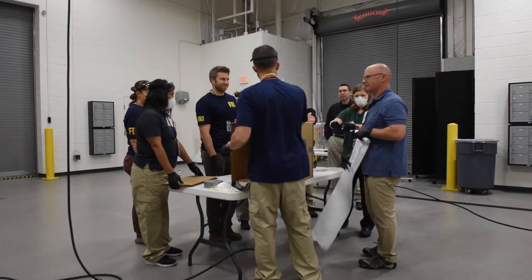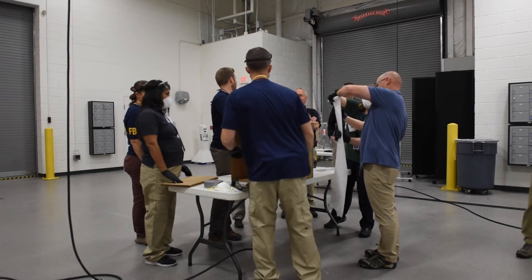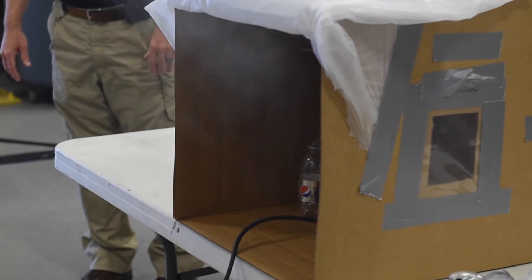Cyanoacrylate, which is really superglue, adheres to surfaces - it's adhesive. By introducing heat to it, we change the liquid to a vapor, and that's what we do with these chambers you see behind us.